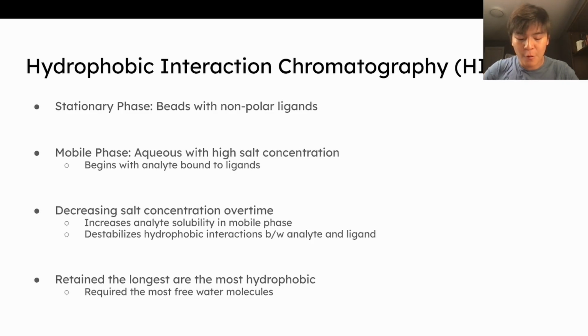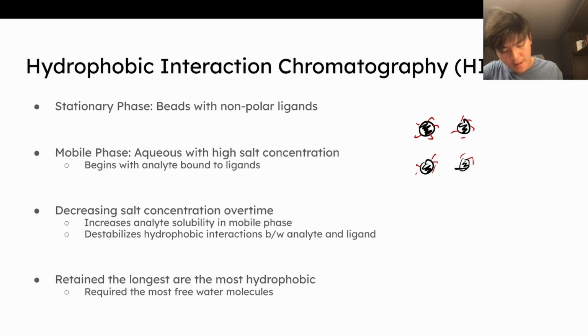Okay, hydrophobic interaction chromatography. This one is very similar to reverse phase chromatography, but is different in how it works, and I'll go over it now. Again, the stationary phase is the same thing: we've got beads with non-polar ligands, but they don't have a non-polar solvent on them now. The mobile phase is an aqueous solution, full of water with a very high salt concentration.